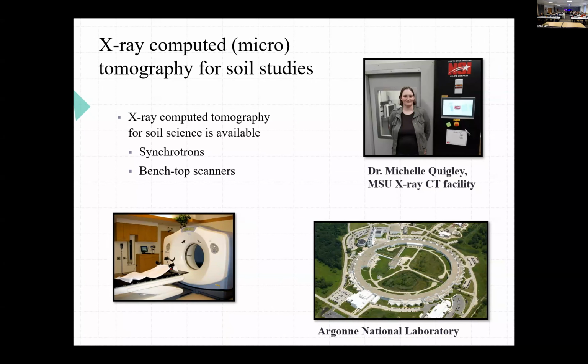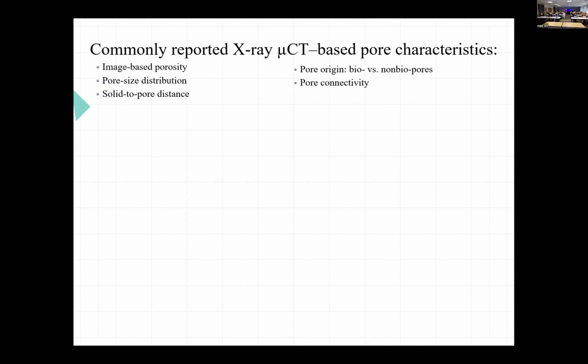And again, I think it's so wonderful that MONet is considering and using this scanning and looking at pore structure in intact shape, because I think this is ultimately the right way to proceed. As I said, I will be talking about some examples of using X-ray CT scanning for soil pore characterization.